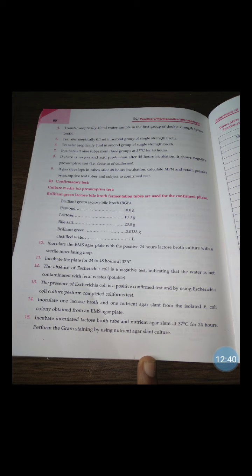Then inoculate 1 lactose broth and 1 nutrient agar slant from the isolated E. coli colony obtained from the EMB agar plate. Then incubate the inoculated lactose broth tubes and the nutrient agar slant at 37 degrees Celsius for 24 hours and perform the gram staining by the use of the nutrient agar slant.